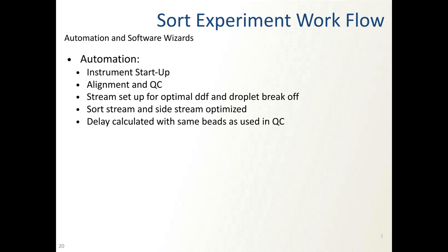The machine does a really, really good job of maintaining the stream. And that's basically the biggest deal of sorting. I mean, if your delay is off, everything goes to crap. And we have confidence that for the first time, that full level of automation, in one click, is really working great. And now there's a couple other instruments that have that too, and it's made flow, or flow sorting, a much easier process.